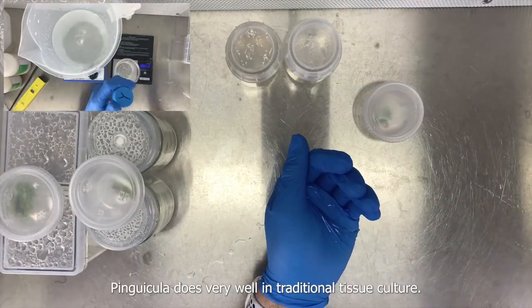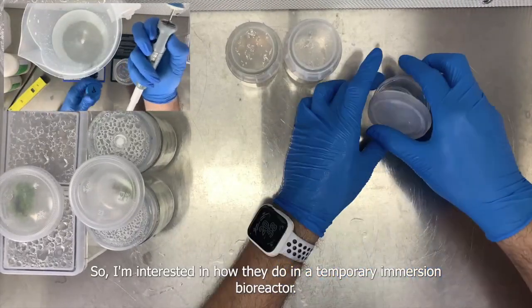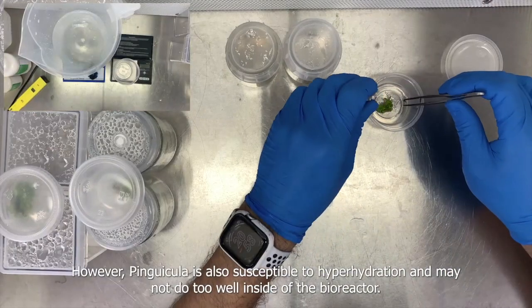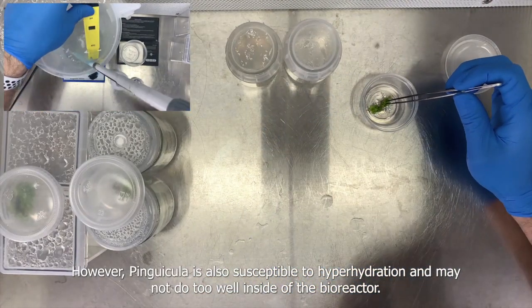Pinguicula does very well in traditional tissue culture, so I'm interested in how they perform in a temporary immersion bioreactor. However, Pinguicula is also susceptible to hyperhydration and may not do too well inside a bioreactor, but we may have a surprise.